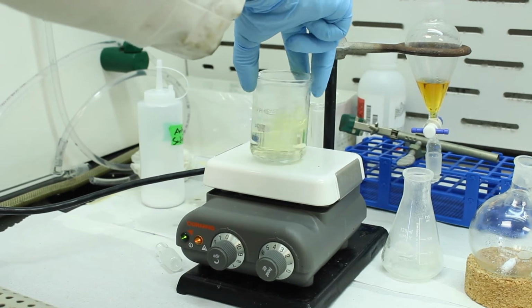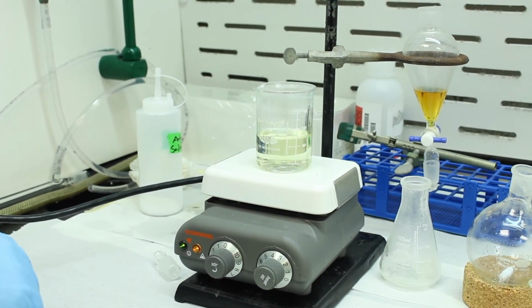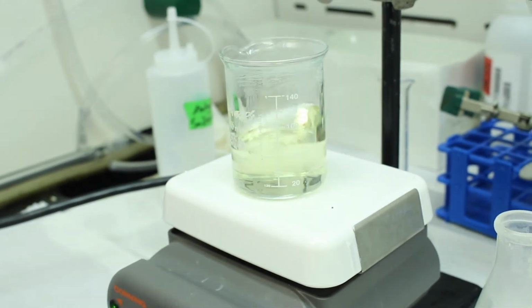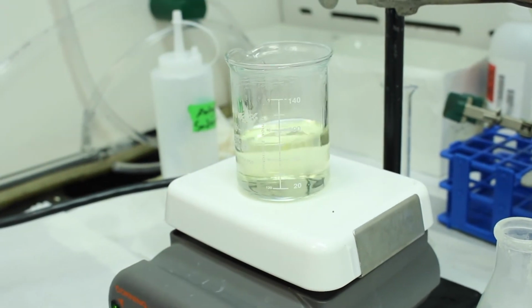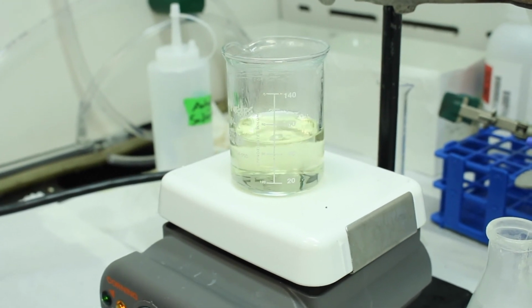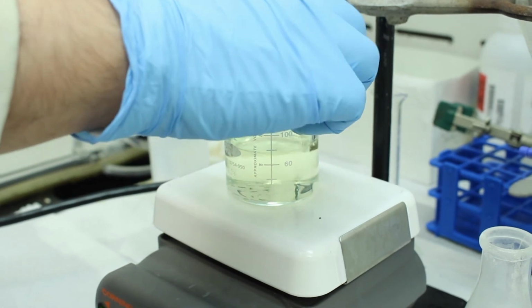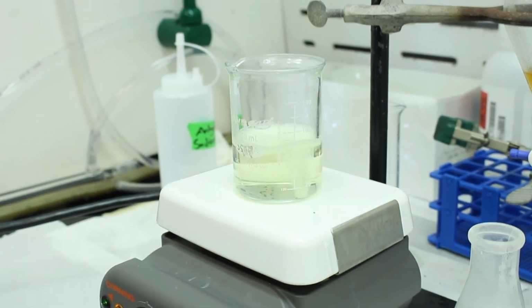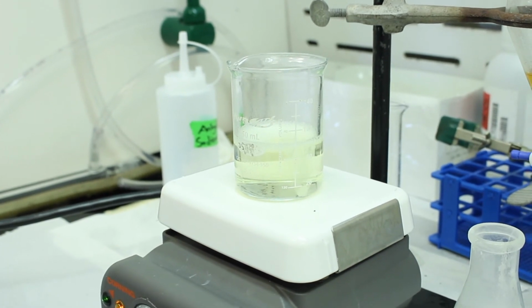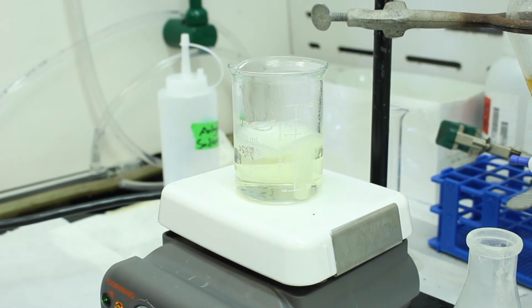I'm going to stir it periodically to make sure it doesn't bump. In fact, what I'll do is I'll take it off, let it cool a little bit and add a boiling chip so it boils nicely. Okay, so we added a boiling chip, so now it's going to boil smoothly.